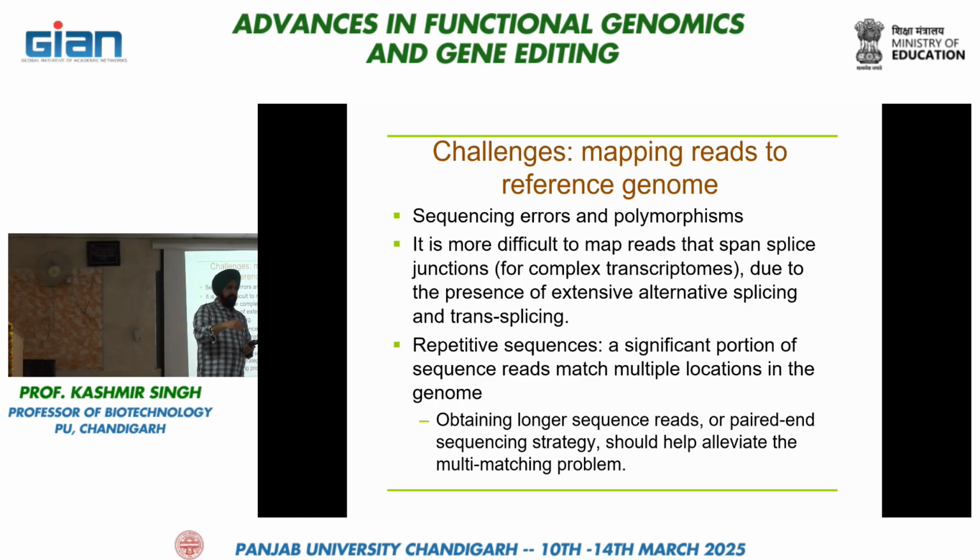Okay, then it may skip some of the As or it may add some of the As in your data. So this is one problem. Suppose it has accurately sequenced that. Suppose there are only 10 As in the data and it has generated only 10 As and that are correctly sequenced. Then the problem comes in the assembly of the data.